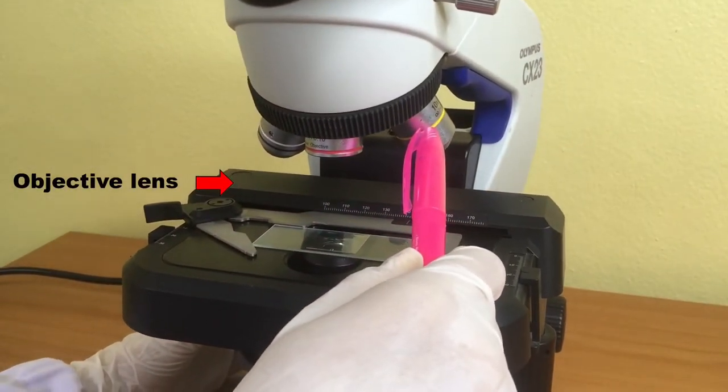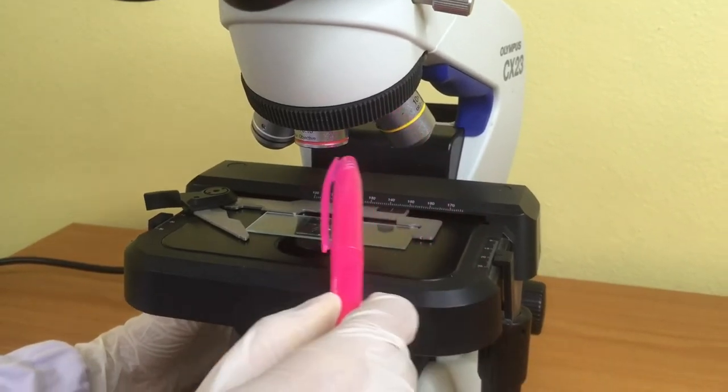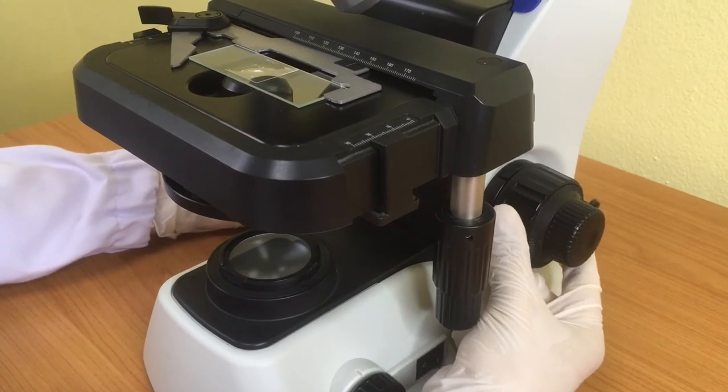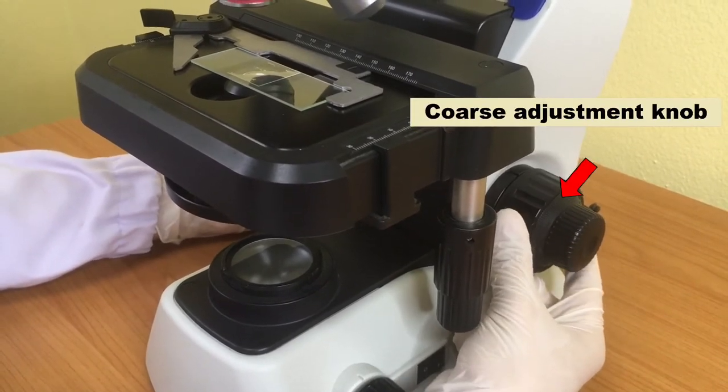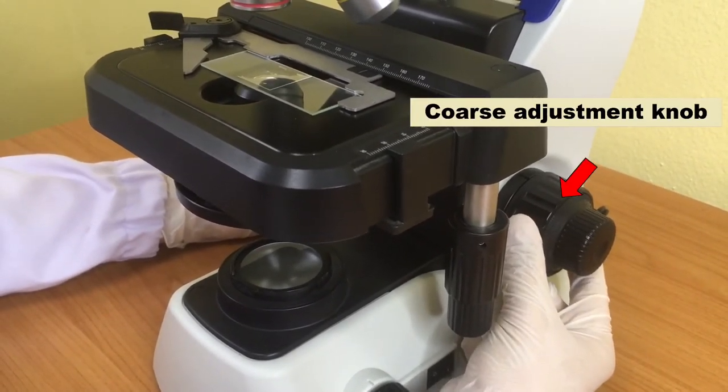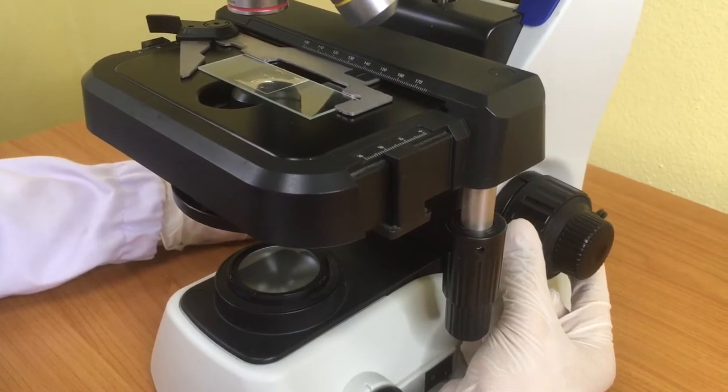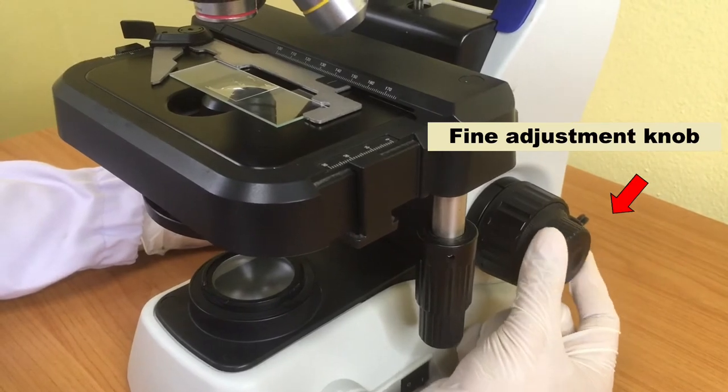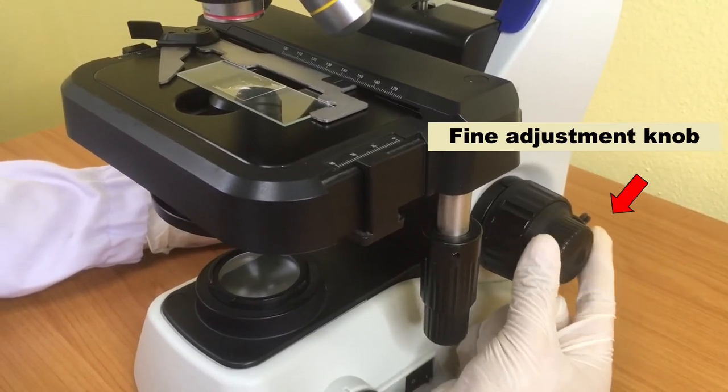At the lowest magnification of the objective lens, use the coarse adjustment knob to bring the specimen in focus. If the image is already in focus and you need to bring it to sharp focus, you need to turn the fine adjustment knob.